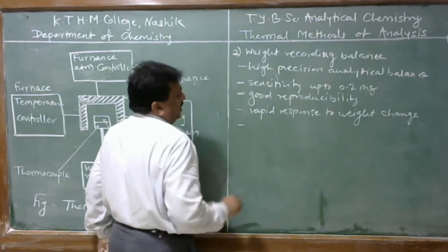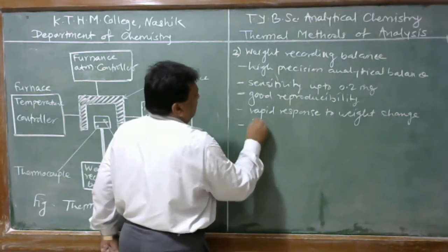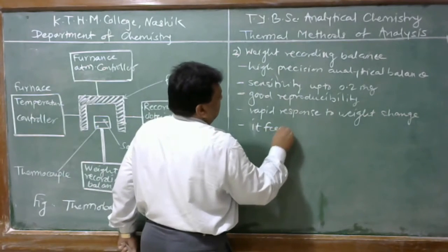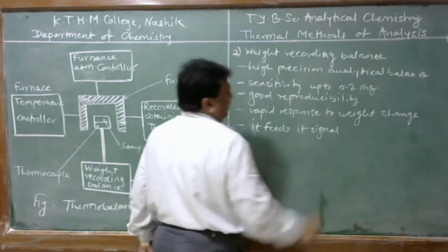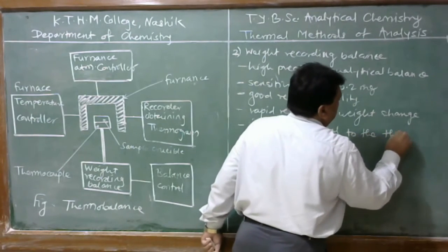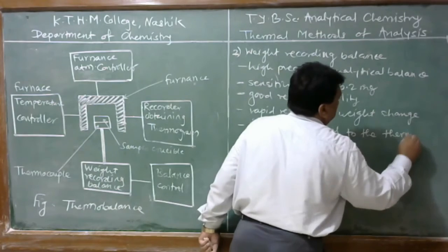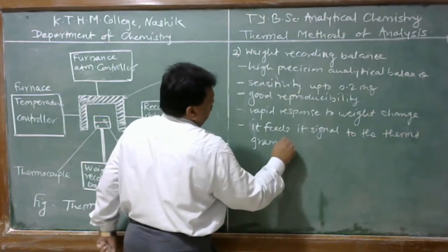And here the balance feeds its signal, that is the change in weight signal, to the thermogram recorder.